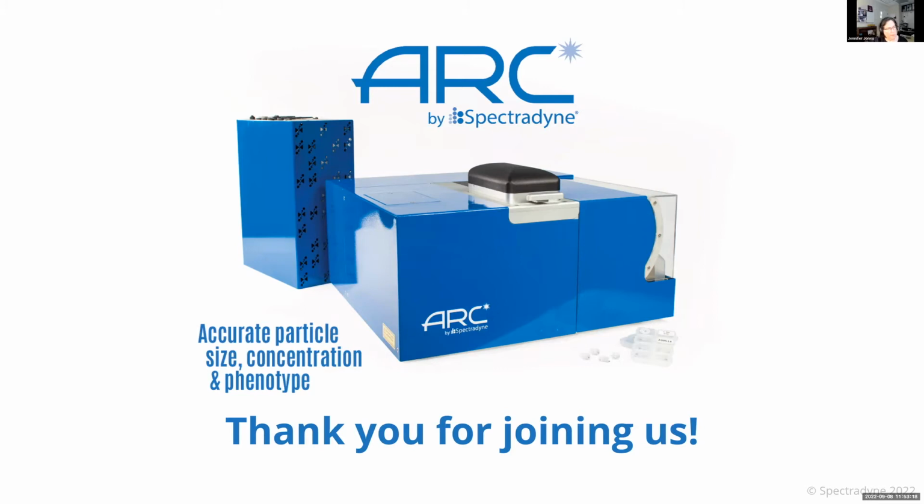And there may still be coincidence challenges where a particle could run through the resistive pulse sensor and a fluorophore could coincidentally be detected by the detector. So the same sorts of efforts that we have to think about to reduce the amount of background fluorescence will probably have to be considered with this as well. I see. Yep, that's a good point.